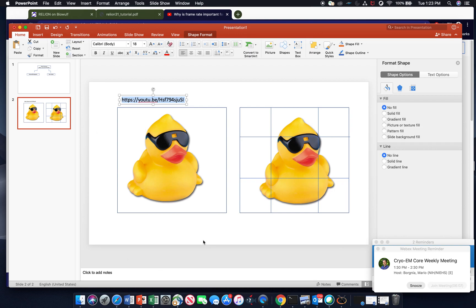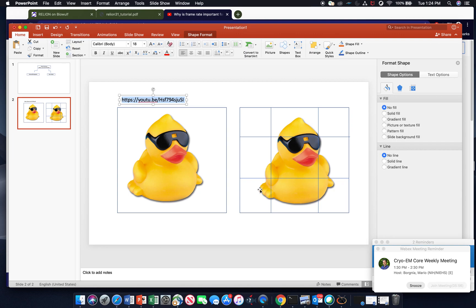So here we have a one by one tile in which this entire picture of a duck would be motion corrected as one large tile. And then this would be a three by three motion corrected image where each one of these individual tiles would be traced individually.